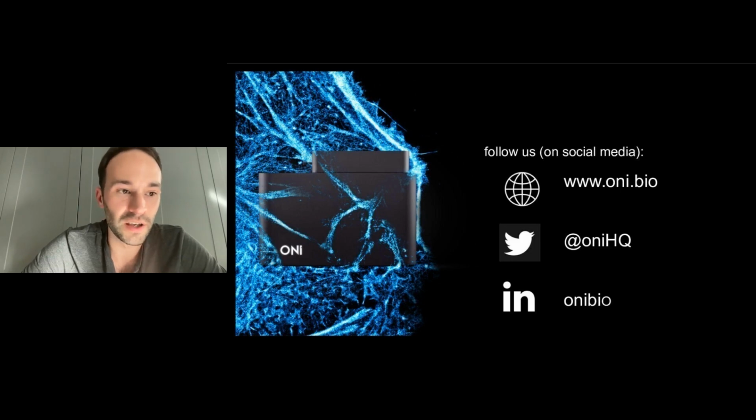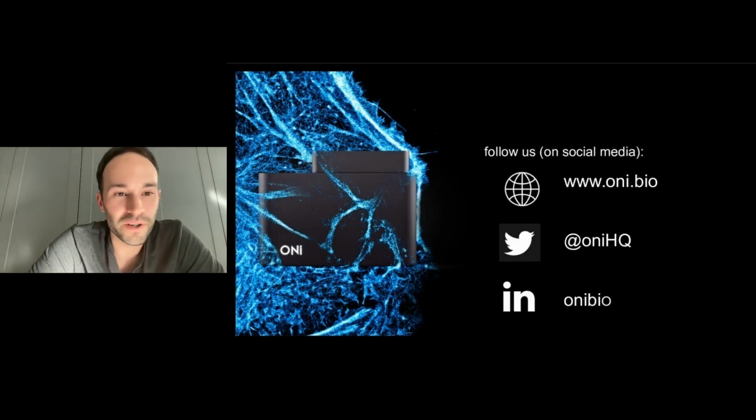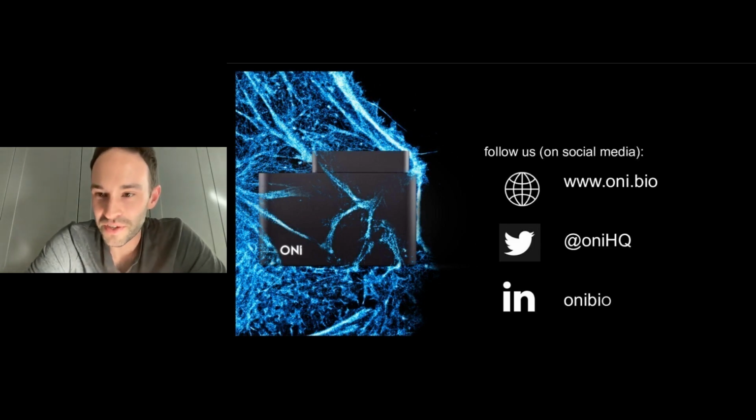People have actually imaged in the back of vans in the past, which, as you can imagine, is slightly shaky. We at one point were exploring putting it in a medevac helicopter so that you could use it for diagnostics of people being evacuated from war zones in a helicopter. So I think that says a lot about how stable the system is.